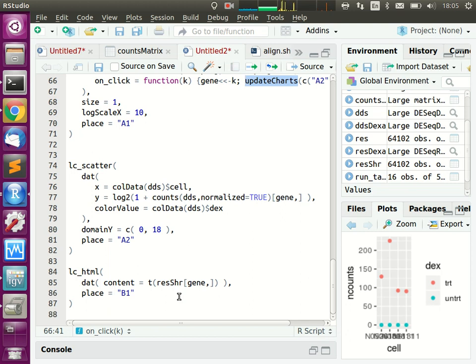You've seen a bit how you can inspect RNA-seq data. We should talk a bit more about how to do complex designs, like, for example, they had this double drug, how good experimental design should be made, how many replicates we need, and why they seemingly didn't have replicates. Each cell line drug combination was only once, and why this is still fine.